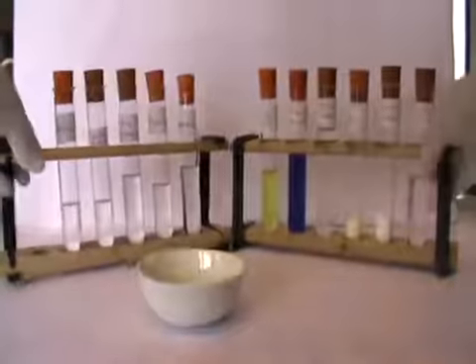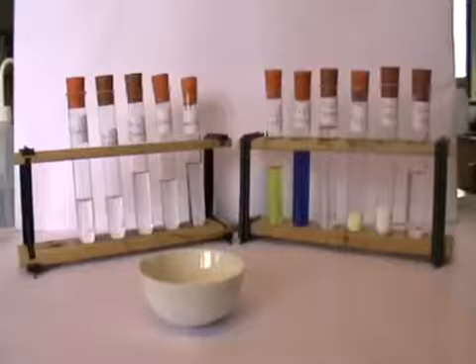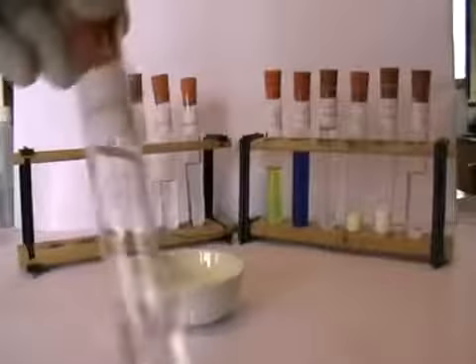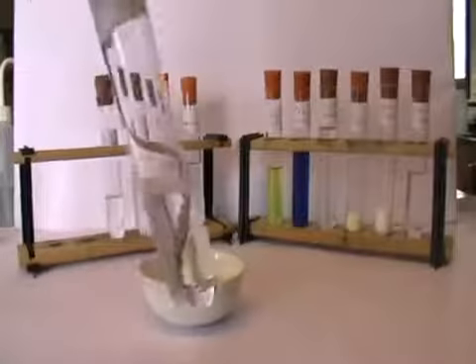Okay, the first thing I'm going to do is to test to see if these 5 organic chemicals will burn. So I'm going to take first of all some of the ethanol. Here I have ethanol, which you can see is a colourless clear liquid. Let's record the smell of this liquid.